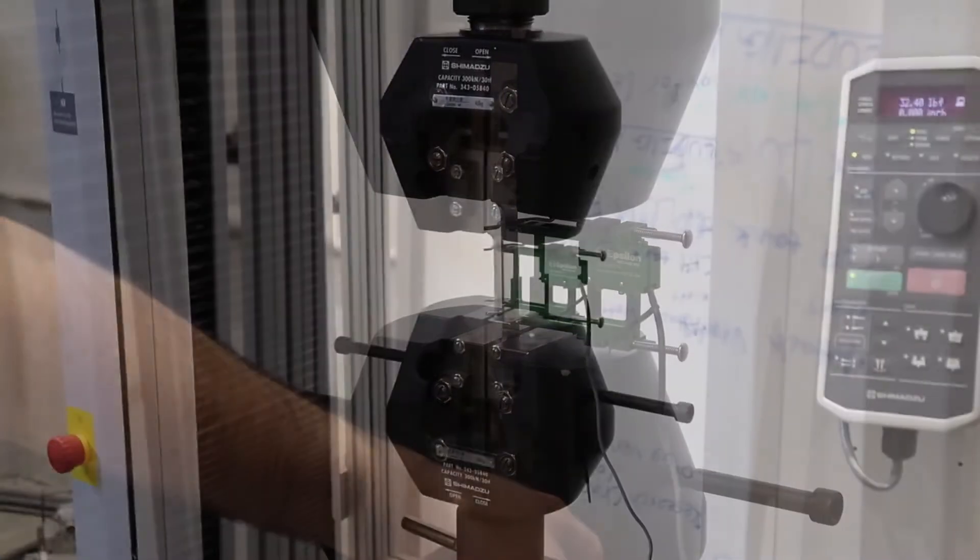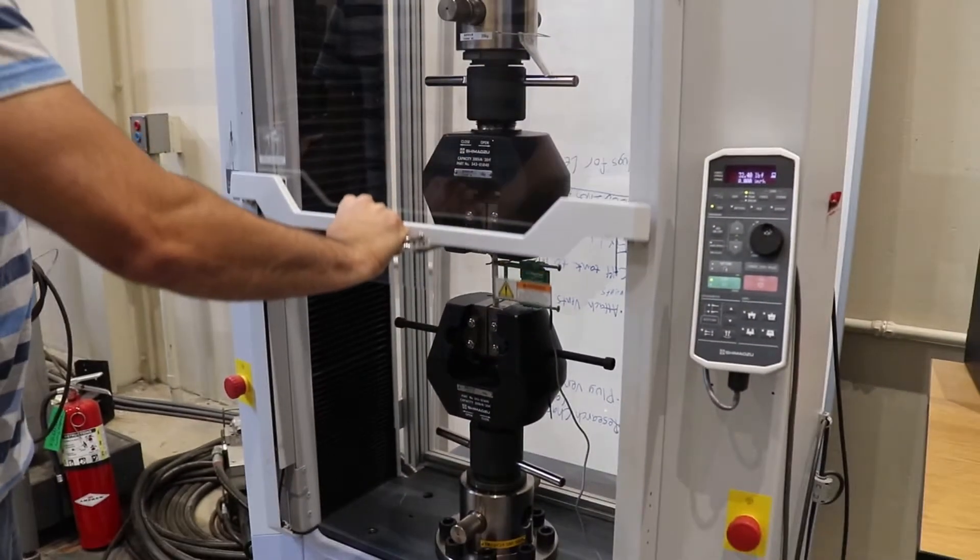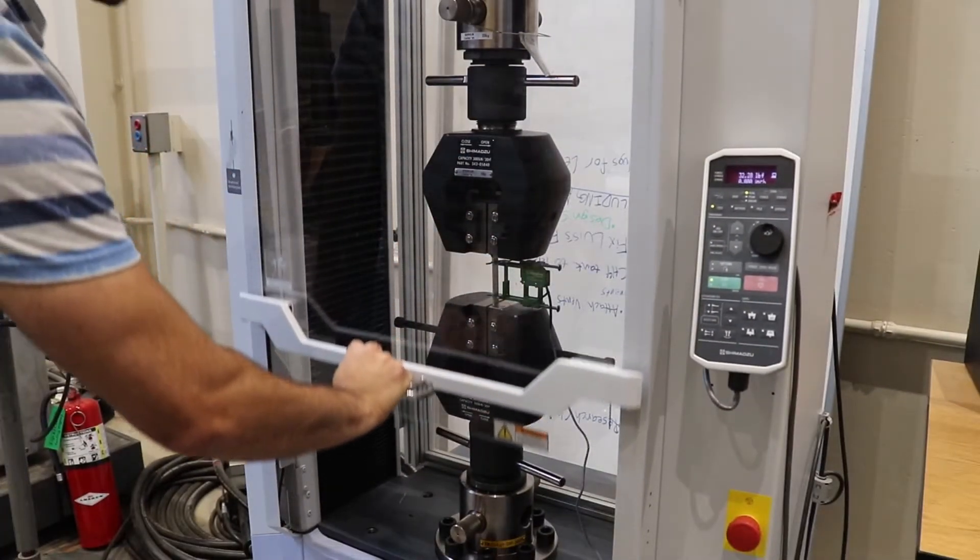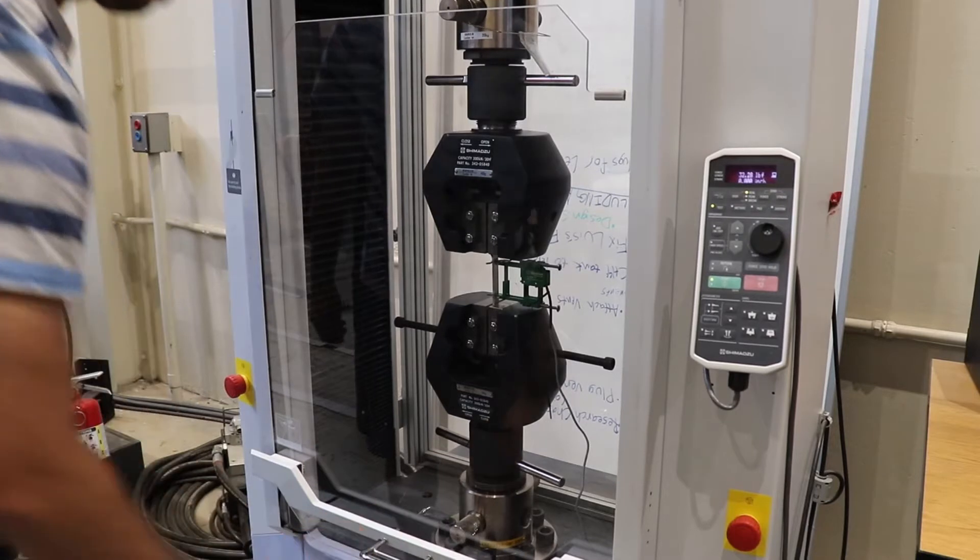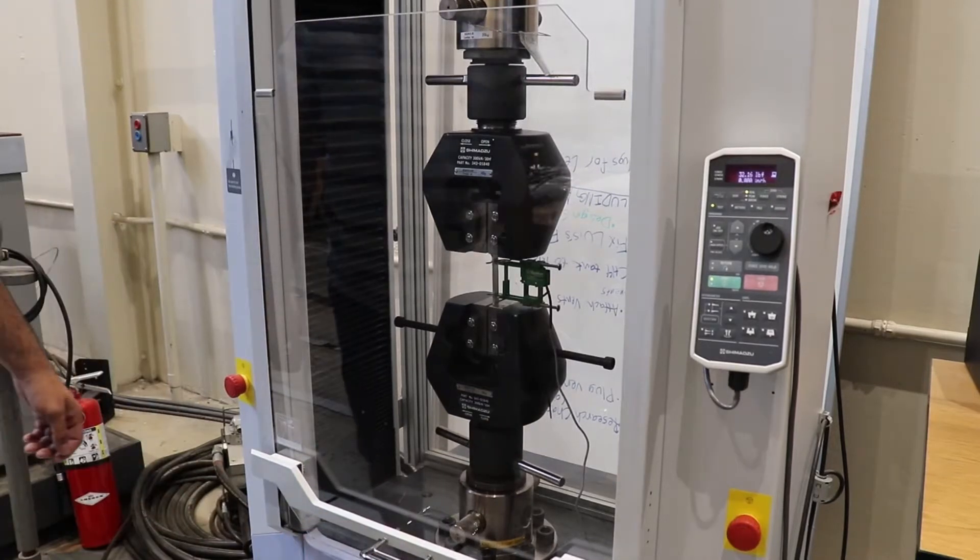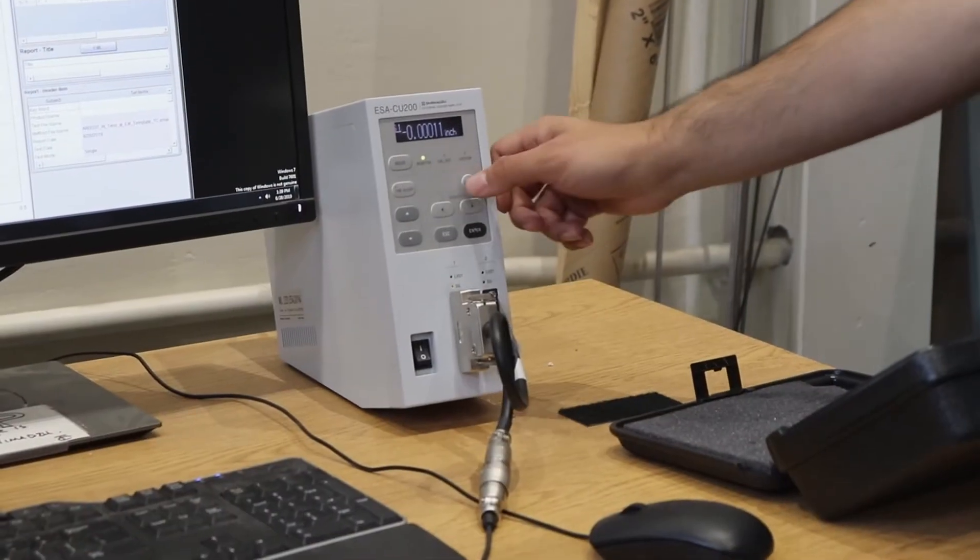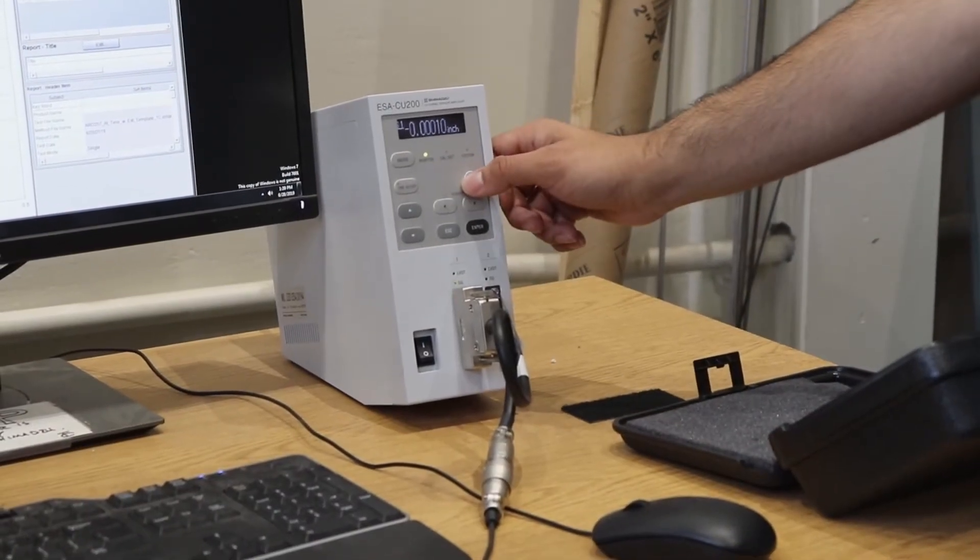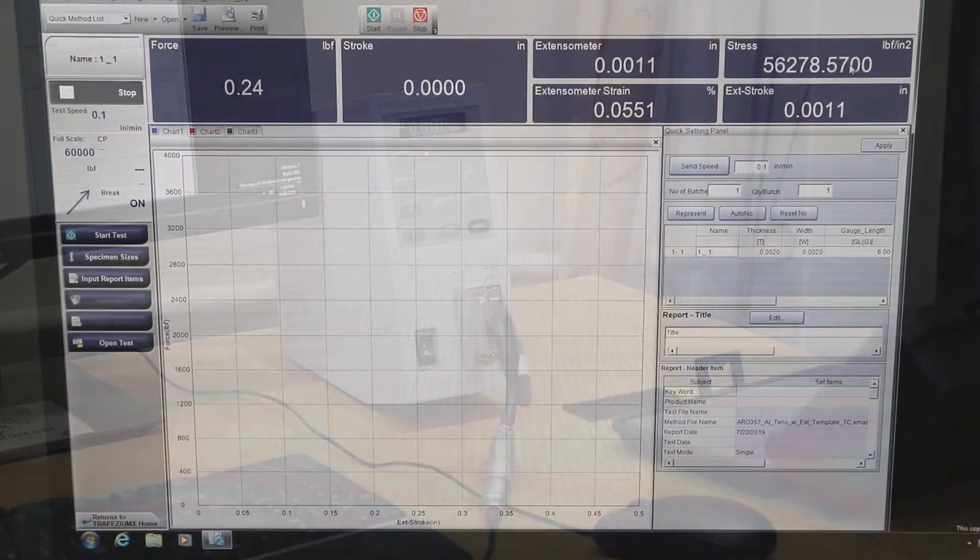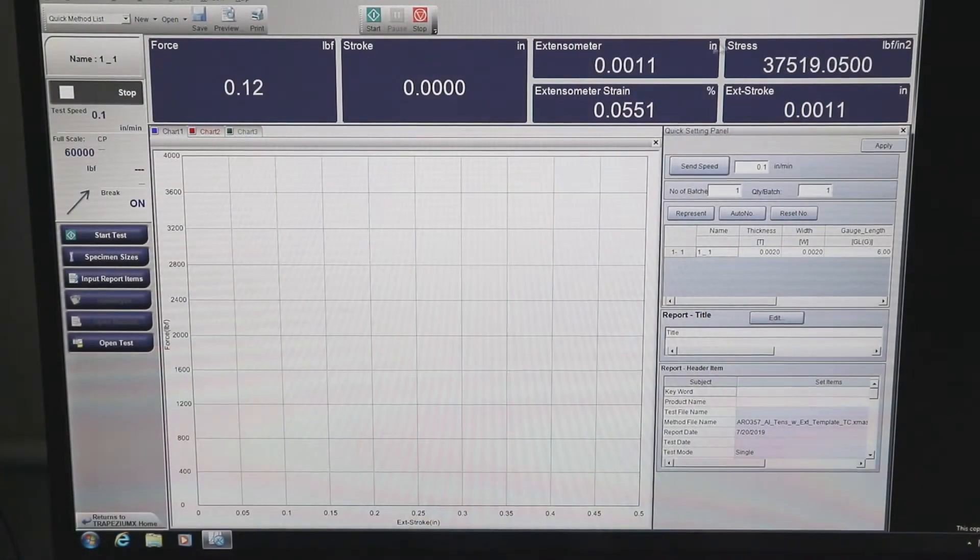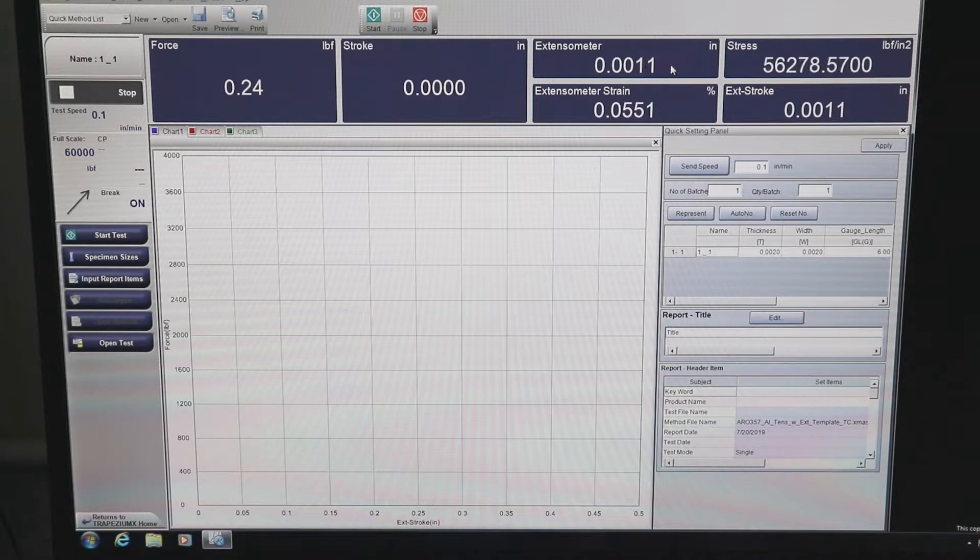To perform the experiment, the shield needs to be engaged fully in its downward position. At this point, we will zero the extensometer on the ESA, and also within the software by right-clicking on the extensometer and going to zero.